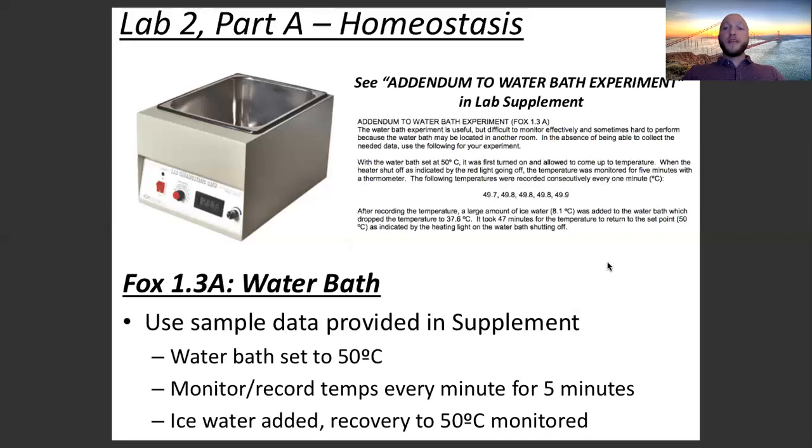Well, with that being said, let's get to it. So FOX 1.3a is the water bath experiment. This one works well as a thought experiment. I think most students are familiar with what a water bath is, but for those of you who need a refresher or are not sure, a water bath looks like this thing over here.